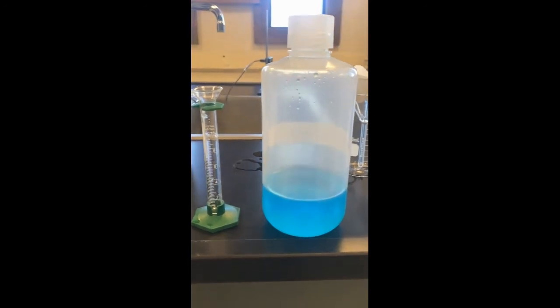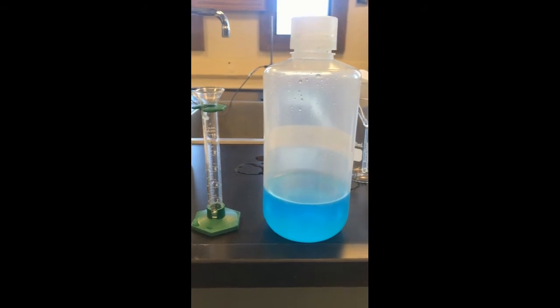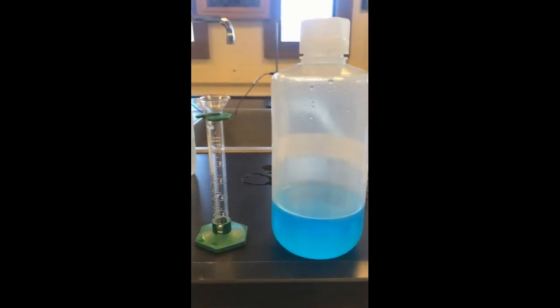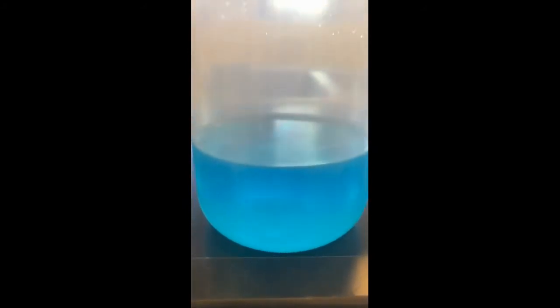As we are waiting for our aluminum to dissolve and singly replace with our copper 2 chloride, I would like to show you the initial observations of our copper 2 chloride. As you can see, we have a clear and turquoise, baby blue colored solution.